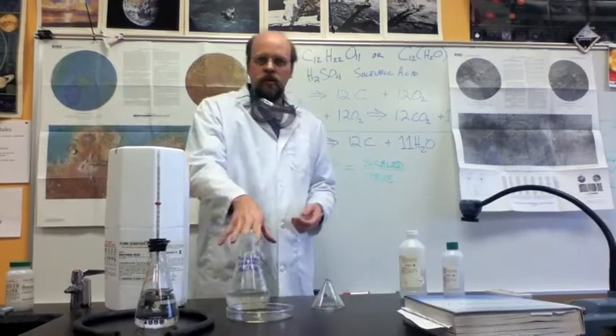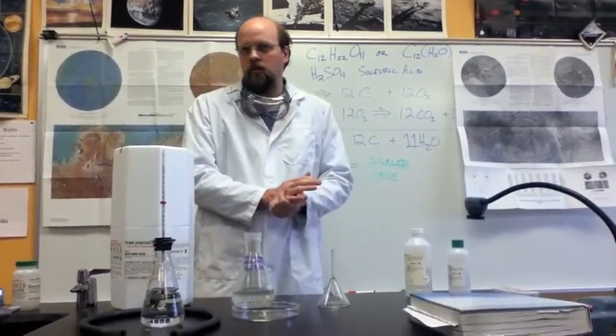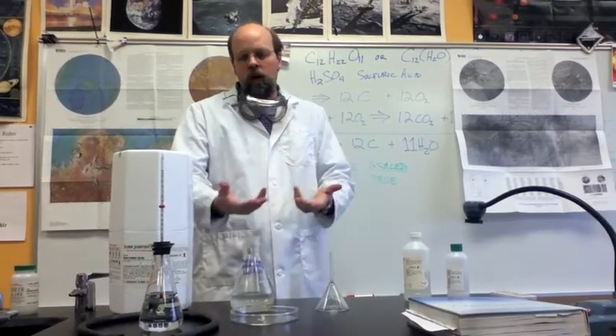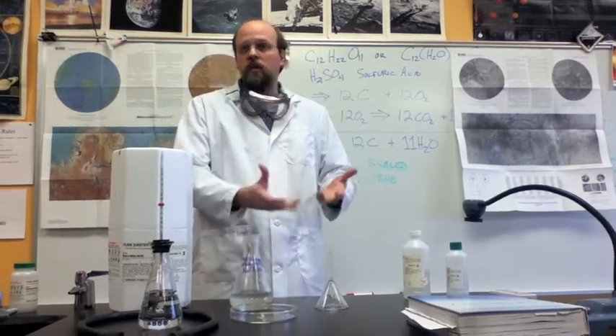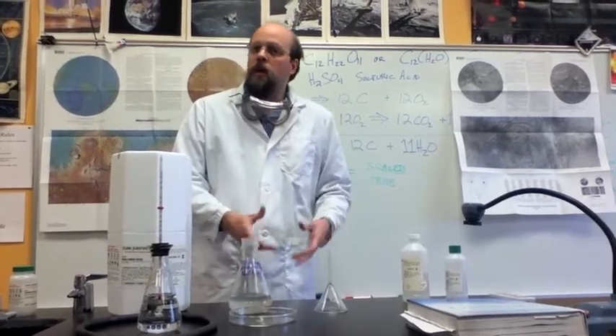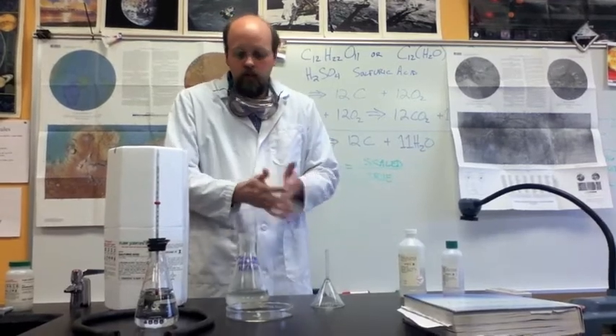I've dissolved more than the usual amount of sodium acetate in this solution than would normally dissolve at this temperature. So when I pour it onto a crystal of sodium acetate, I can cause it to suddenly crystallize all at once, and that process is exothermic — that's the interest we have in it today.